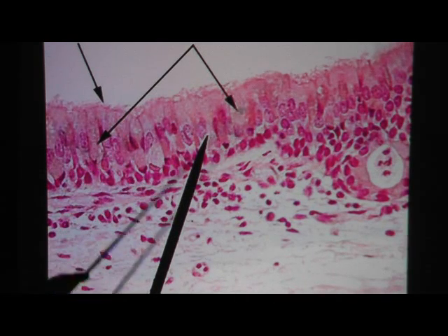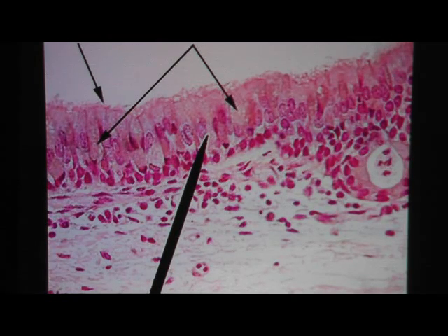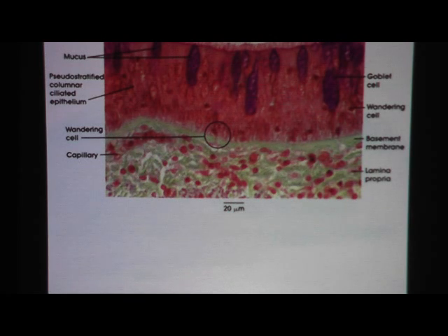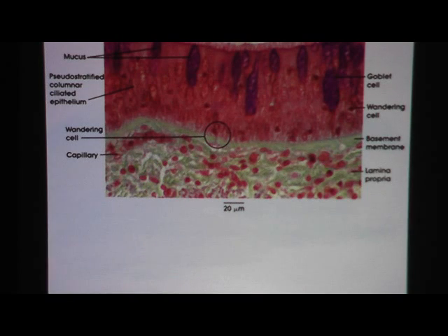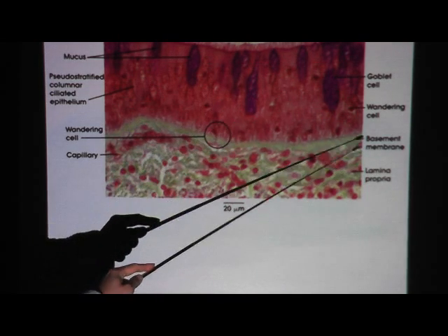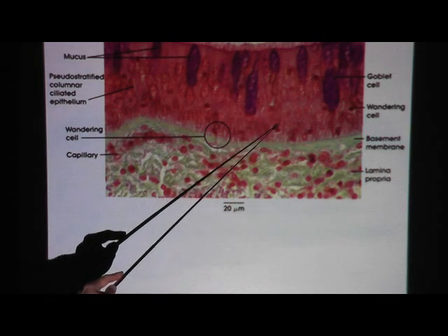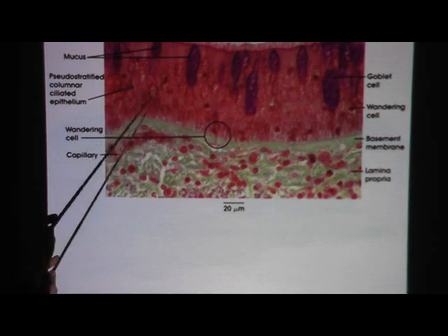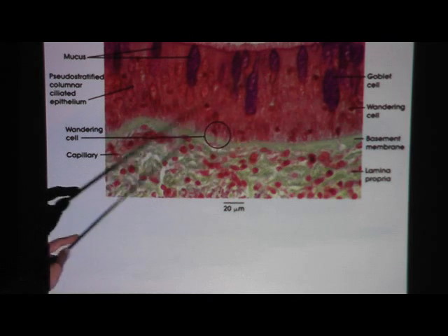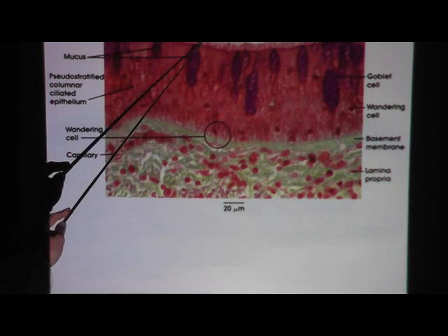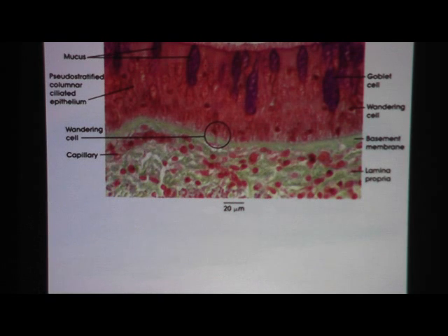There are goblet cells in here. Remember, anytime you have columnar epithelium, be suspicious of finding goblet cells. Here's another view stained specifically for mucin, which is found in goblet cells — it lights up dark purple. These are goblet cells with mucin. The nuclei are the regular red ones scattered in the middle and bottom. Up here at the top we see cilia, and we see the goblet cells releasing mucin. This is ciliated pseudo-stratified columnar epithelium.